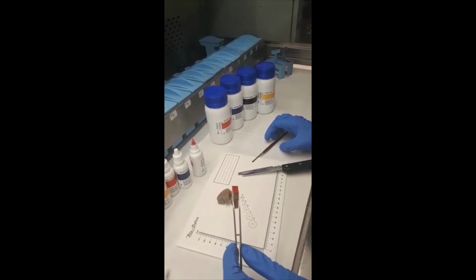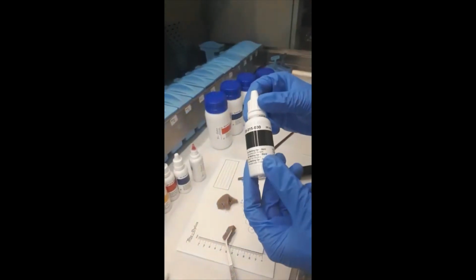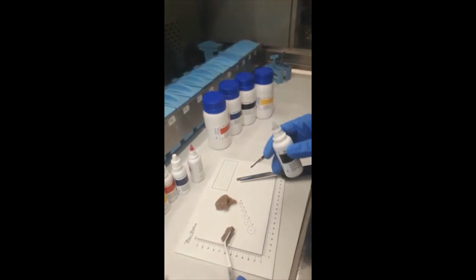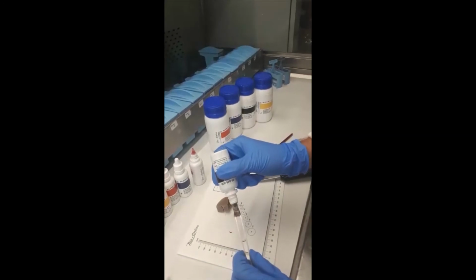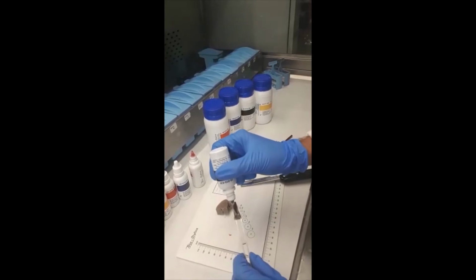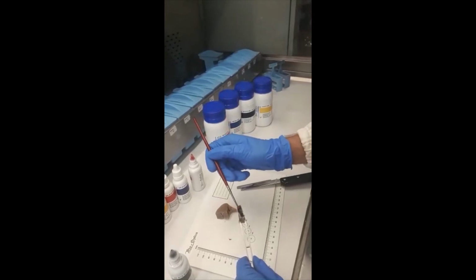If we have to distinguish another margin with another color, we can take a different dye, for example the black one, and we can apply it on the other margin directly with the dropper, and then with the brush.